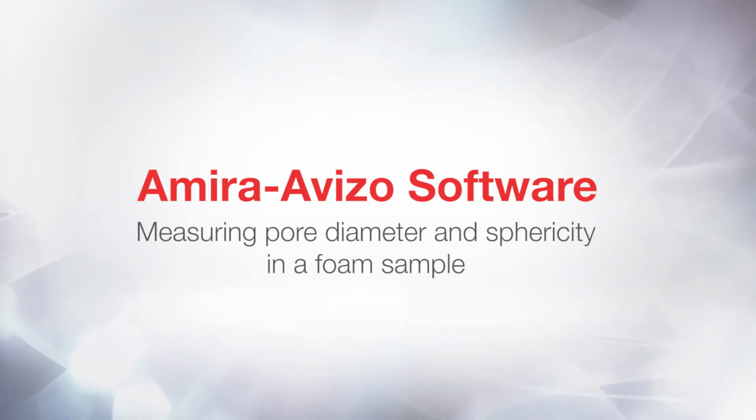In this image analysis example, I'll show you how to compute the distribution of pore diameters in a foam sample and how to define a custom measure to compute the sphericity of pores. To follow this tutorial, you should be familiar with basic manipulation of data within Avizo.